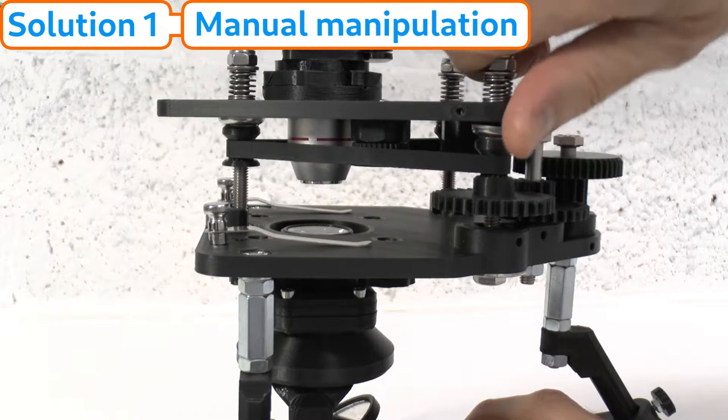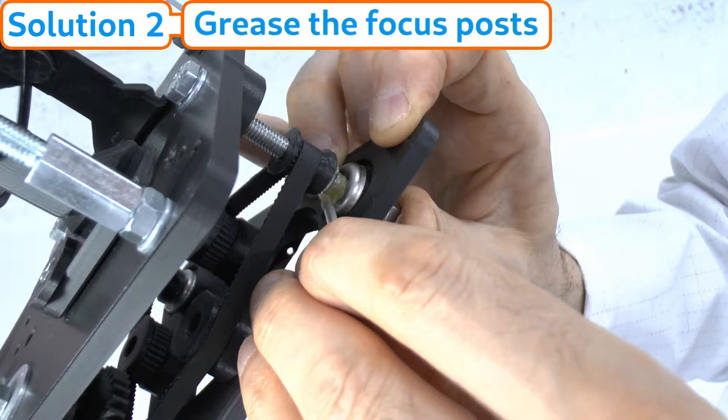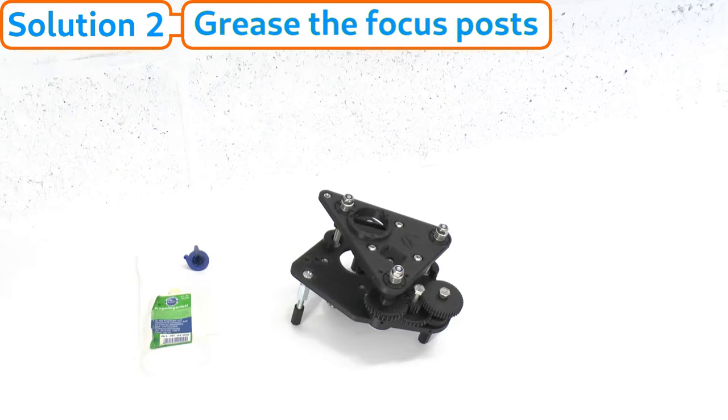If manual manipulation doesn't work, proceed to the next solution: greasing the focus post mechanism. Greasing should be done anyway as part of routine maintenance at least once a year, regardless of whether you experience a sticky focus platform, as a preventative measure to keep focus action smooth.